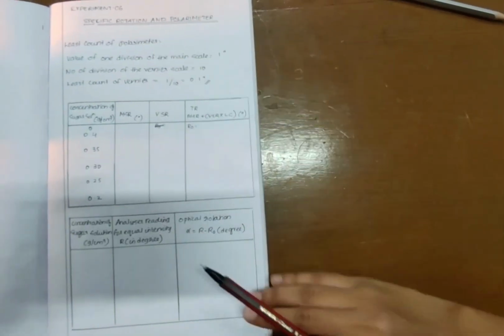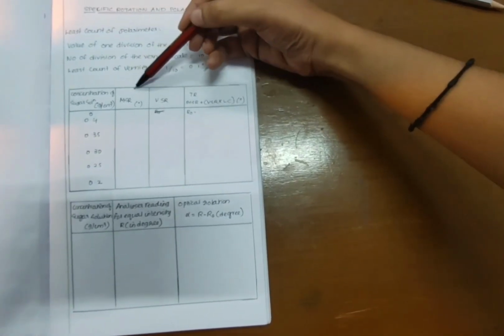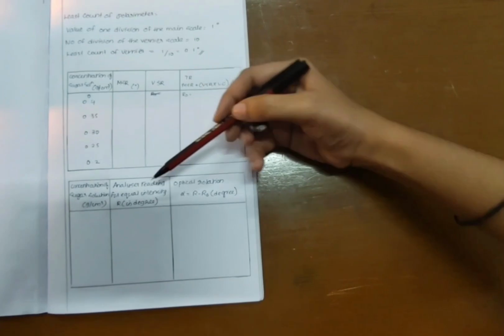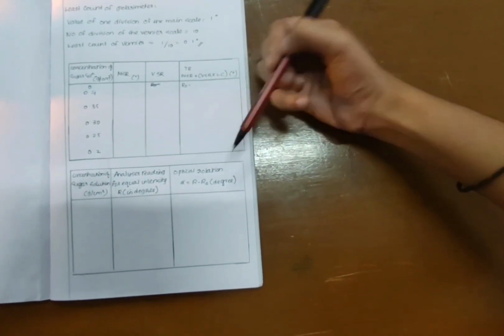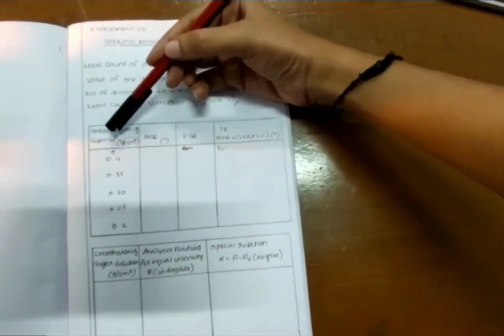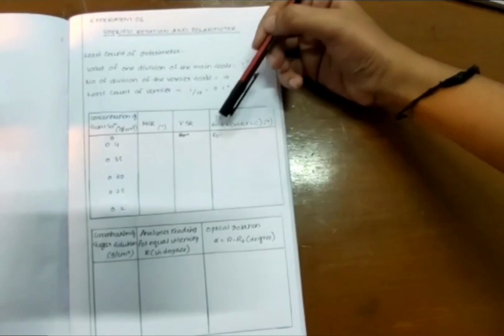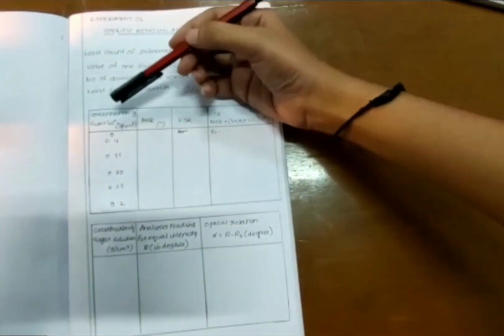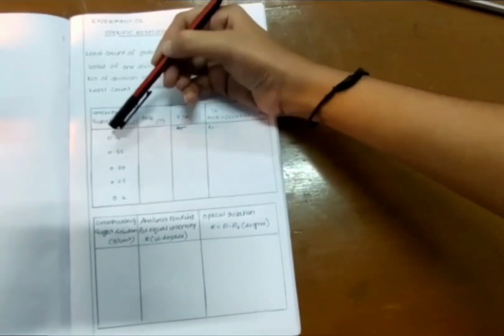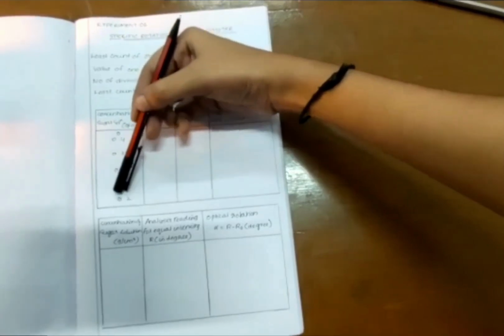Here we have two tabular columns. One is for taking the readings, MSR reading, VSR reading and total reading, and the next one is for finding the optical rotation. At first, we are going to take the reading for sugar concentration 0, and that will be R0, which is a reference value. After that, we will be taking readings for different concentrations of sugar solution, that is 0.4, 0.35, 0.30, 0.25, 0.2.